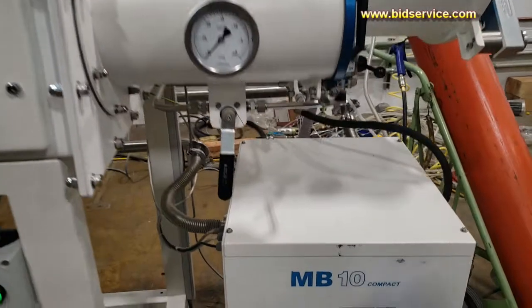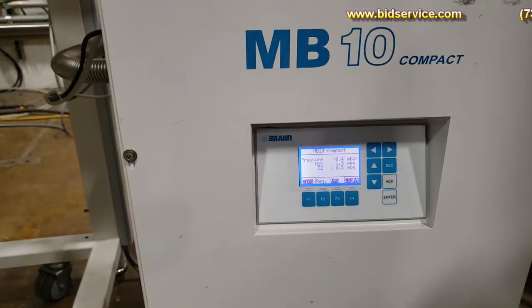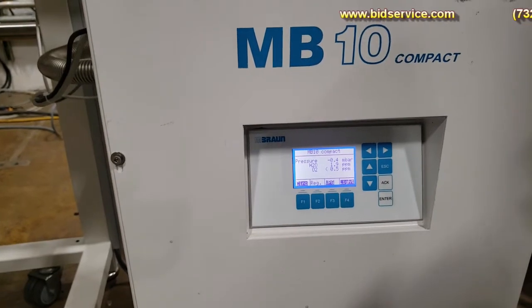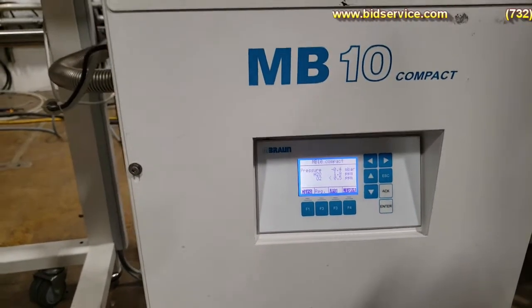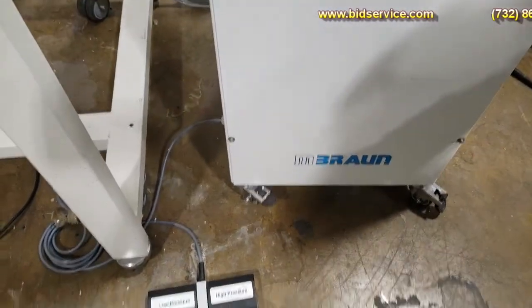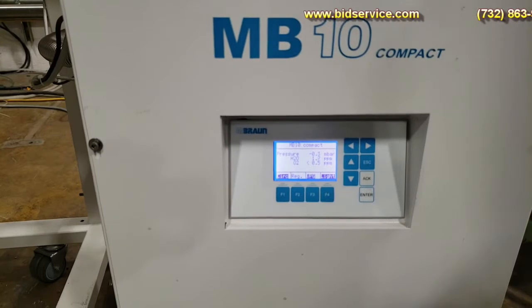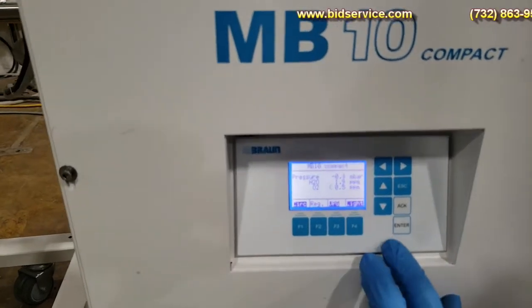Here's our control panel for the MB-10. You can see we're at 0.4. We can add a little pressure using the foot switch, and we can reduce the pressure again using the foot switch. I have the range set here to look at the range.